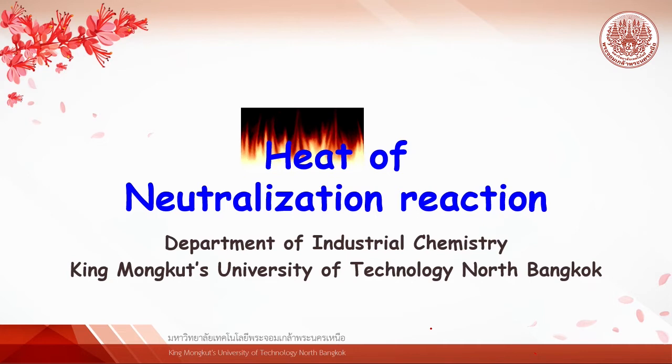Heat of neutralization reaction experiment. The theory in this topic is about heat from chemical reactions. Usually, these reactions are carried out at a constant pressure. So, the heat refers to enthalpy, or H, or delta H.